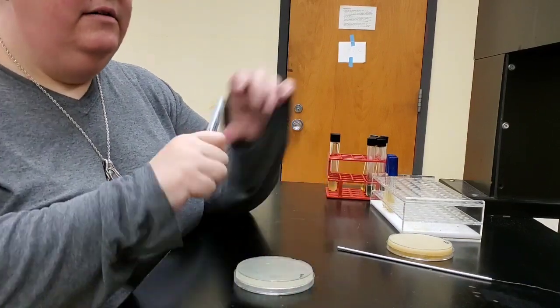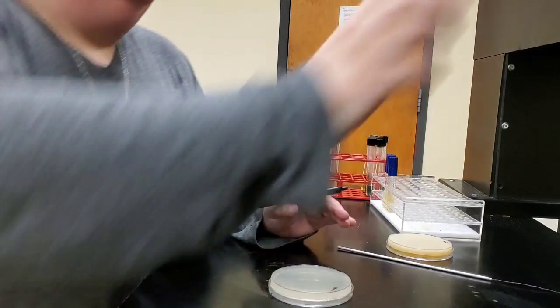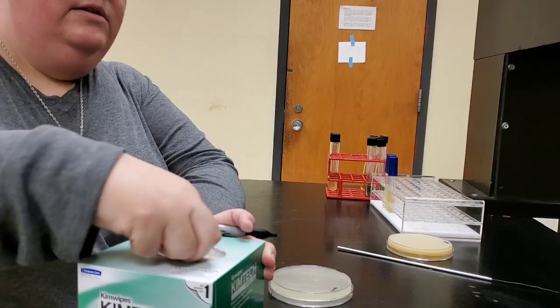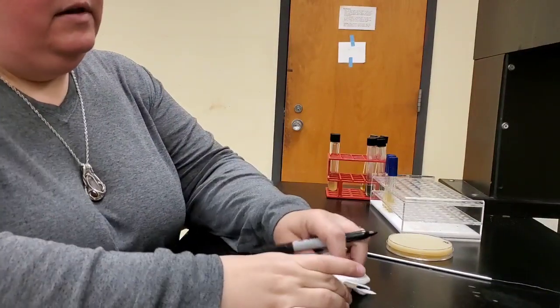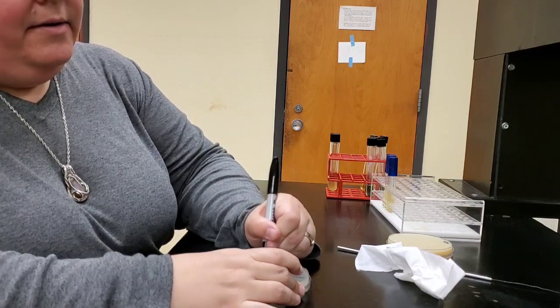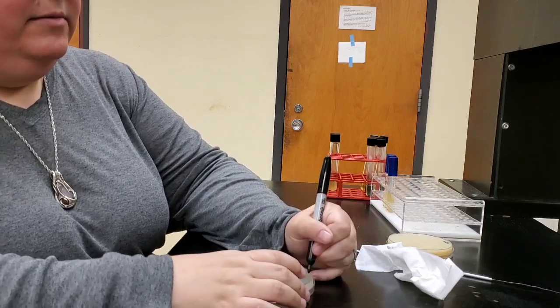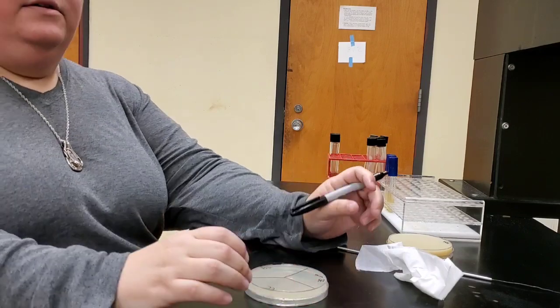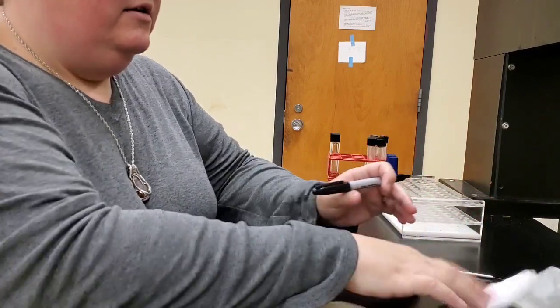So we have a starch plate here for the amylase exoenzyme test. We're going to inoculate this media with 3 microorganisms. So we're going to divide the plate into 3 sectors. One which will label BS for Bacillus subtilis, one will label EC for Escherichia coli, and one will label SE for Staphylococcus epidermidis. We'll do the same thing on our milk agar plate.